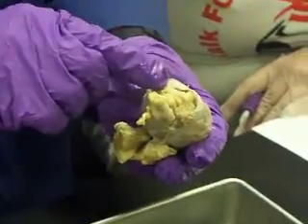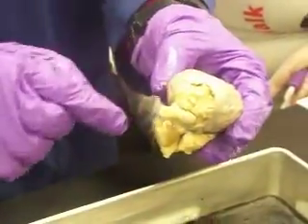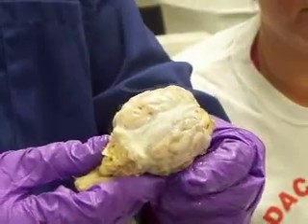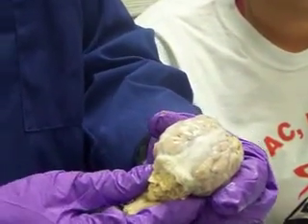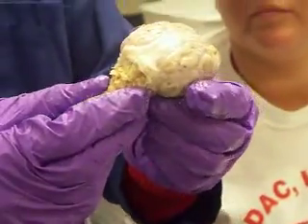This is the cerebellum, and this is not supposed to be like that. See how it's all fragmented, like that? It's supposed to be more rounded, if you will, and it's lost its integrity there. Now, sheep brain is slightly different than a human brain. Well, obviously, it's smaller, right? Sheep aren't very smart, as far as I know. But also the orientation of it.